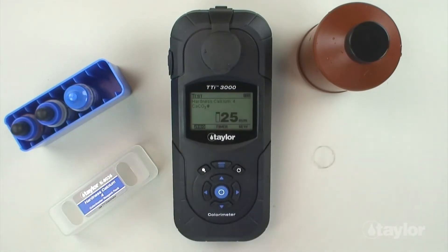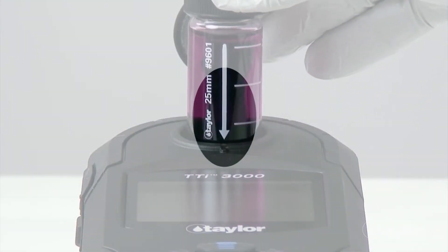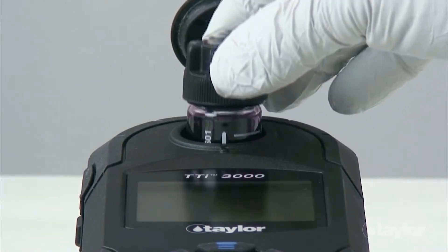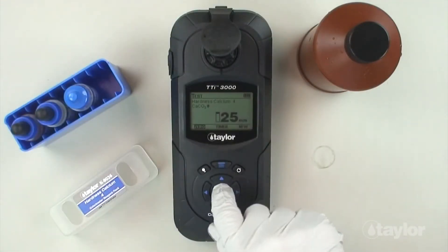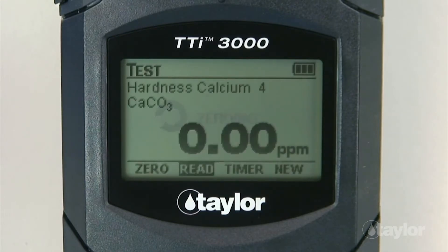Insert the sample cell into the sample cell compartment, aligning the arrow on the cell with the notch on the sample cell compartment, then gently push down. Select 0 using the scroll arrows, then press enter. 0 will be displayed on the screen.